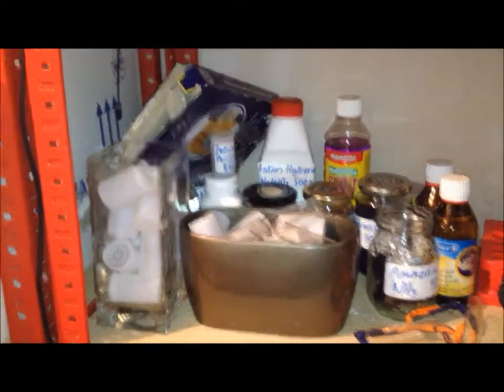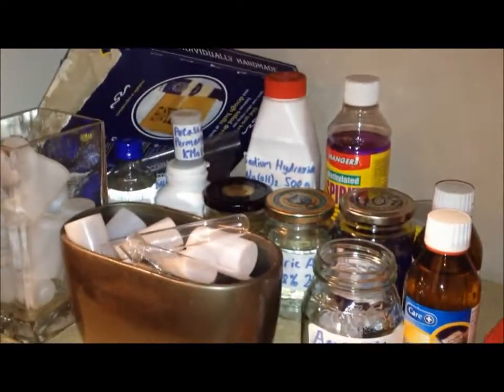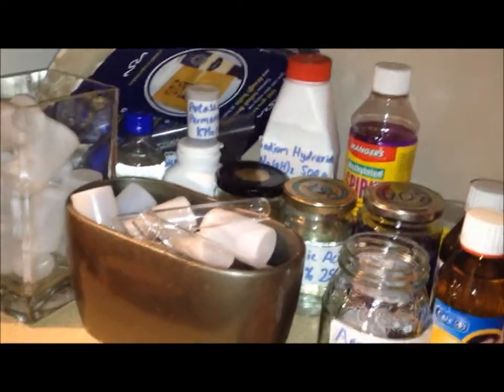This is my main shelf and this is where I keep most of my chemicals. You can see most of them are in there, but there are some acids, some starch solution, ammonia, some spirits, and some oxidizers which I keep separate.